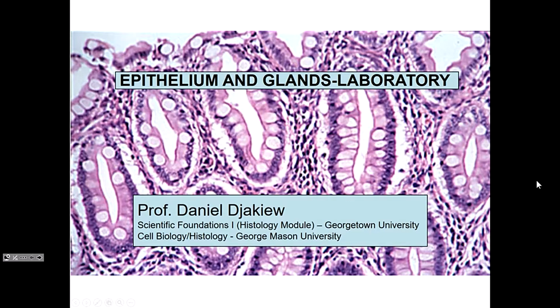But in this day and age, we have a reduced number of faculty and large classes, and we just can't do that anymore. So in its place, what we have is what we call a lab session, where I will show you, hopefully, a good image of a structure that otherwise you would have had to find by yourself with the microscope, and we will discuss the characteristics of that structure, and you will have an opportunity to ask me questions about that structure.